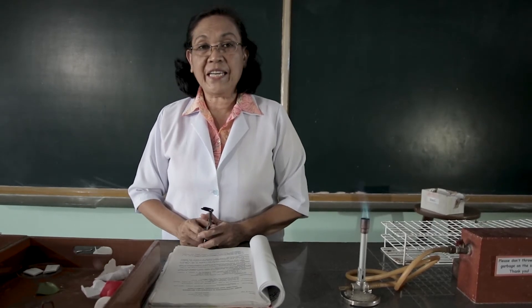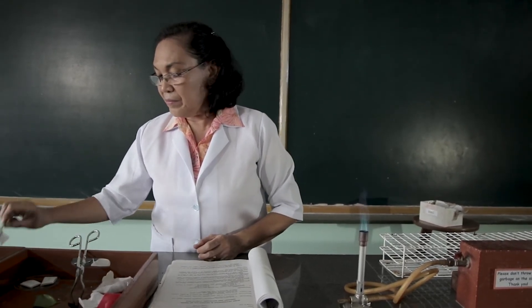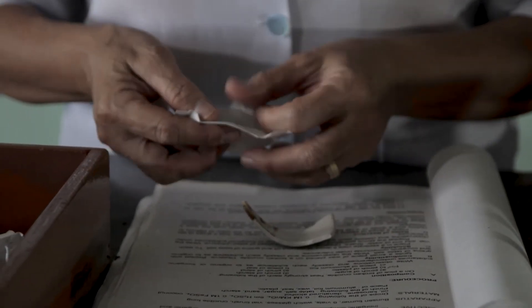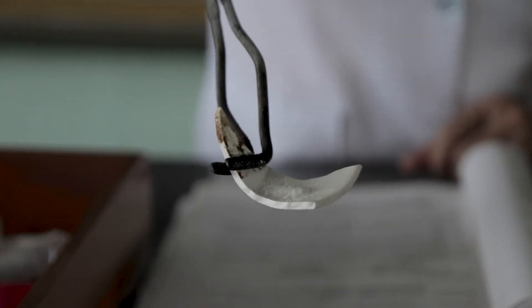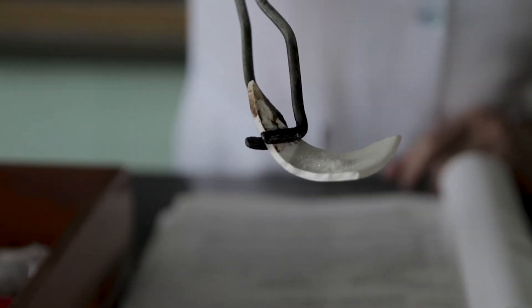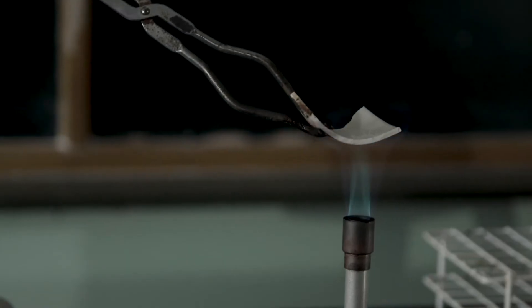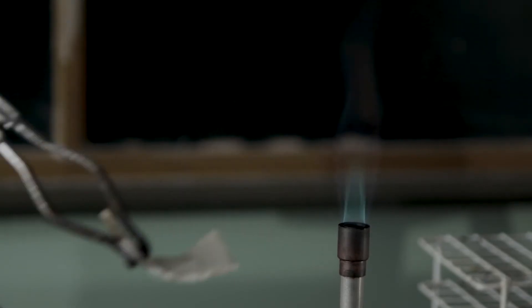Then we are going to heat a table salt. This is the table salt before it is heated. I want you to observe especially its color. Now, we are going to prove whether this table salt is combustible or not. Observe.